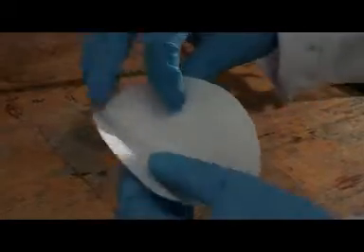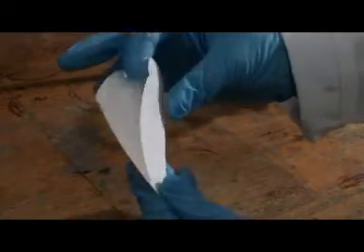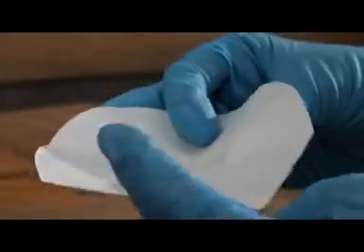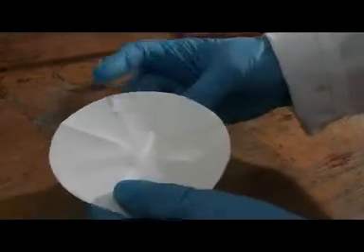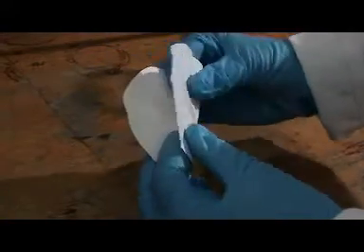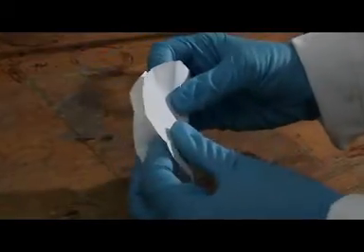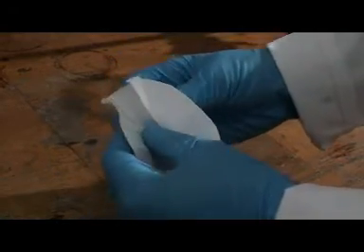To flute filter paper, first fold in half then in quarters. Now make a fold in between those two folds and again between the other two folds. Now turn the filter paper over and make a fold in between each of the folds from the other side. Once you've done that, concertina the folds making them nice and crisp.